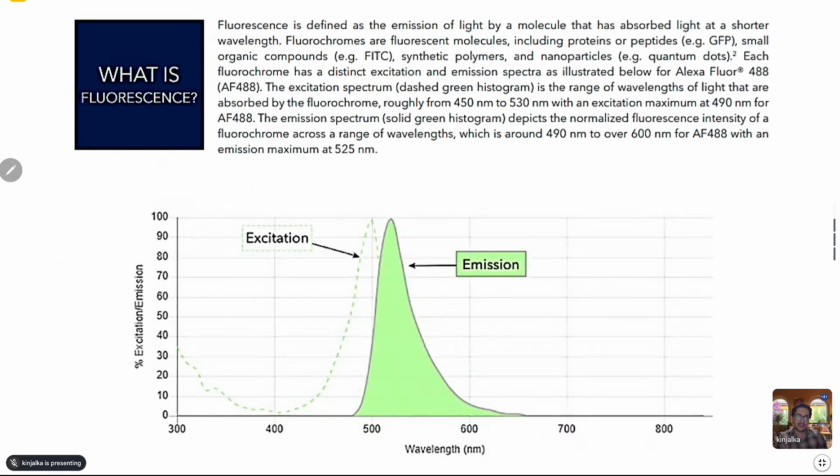And each cell that has been hit or excited, or each antigen antibody reaction gives out an emission. So the software then collates the number of such hits and they call them events, and identifies how many events have occurred. Because obviously you realize that this is again an indirect method of estimation, and there are chances of false positives coming in, cross reaction at the level of antigen antibody reaction. And also because there may be a spillage. It looks green, but green, from our arts class, blue and yellow together makes green, right? So those kind of spillages often happen, and you may get different kind of results from what you expect. Right?